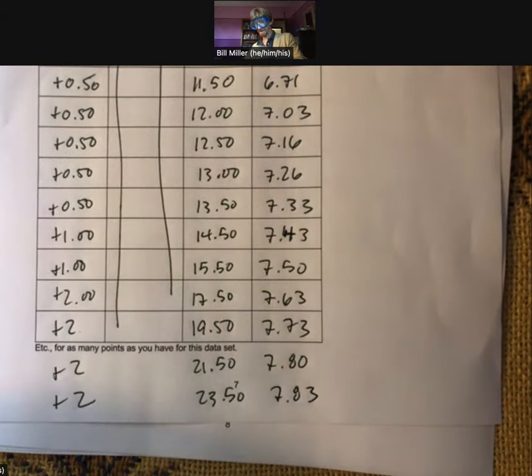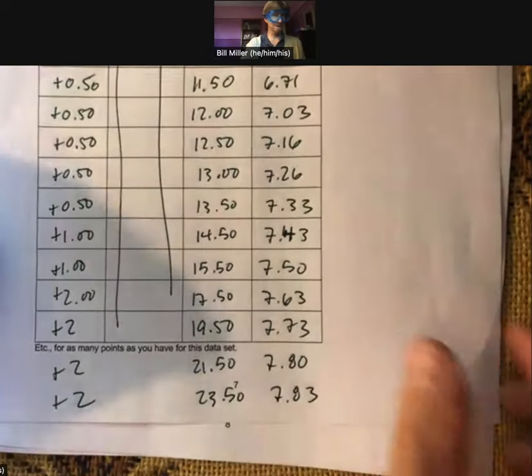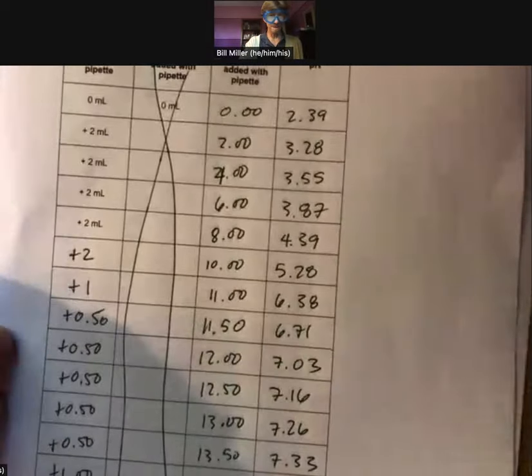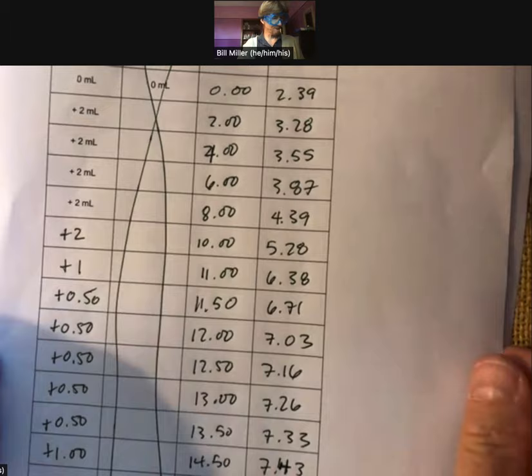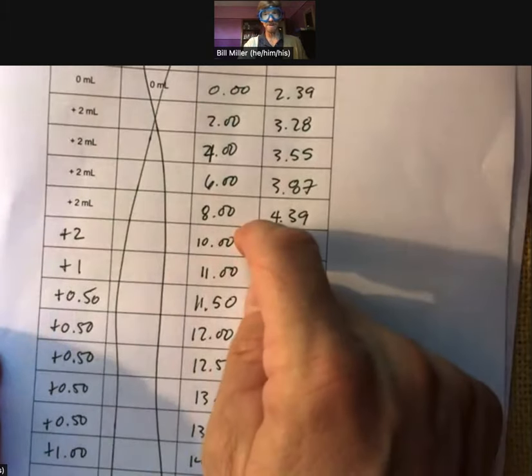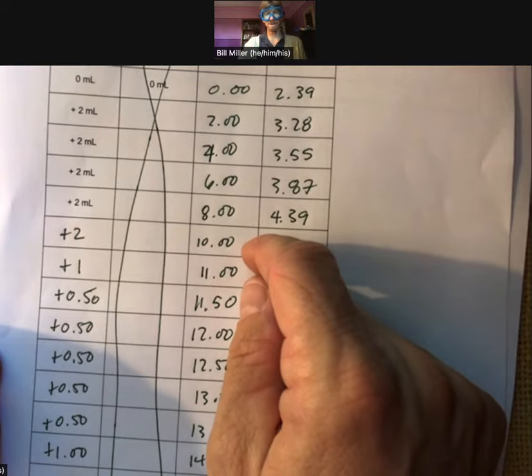This thing's done. I'm going to set that aside — that's the end of our data collection. You have to do that two more times for three complete titration curves. You're going to have one set of data here and make two more versions of this table — print this page two more times or however you want to do it. I will need three of these data sets to be turned in, and you'll see in the Google Sheet where you can do that.